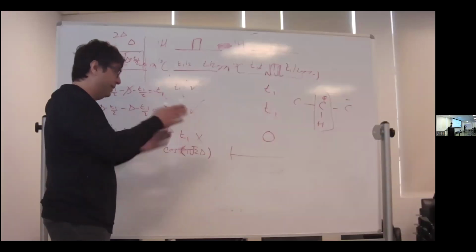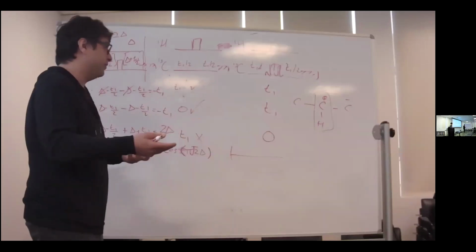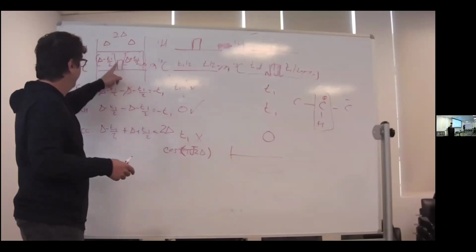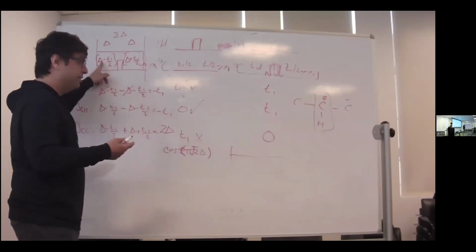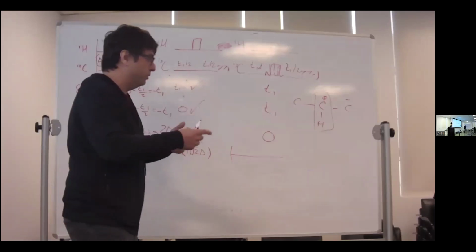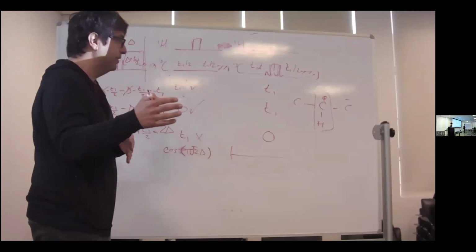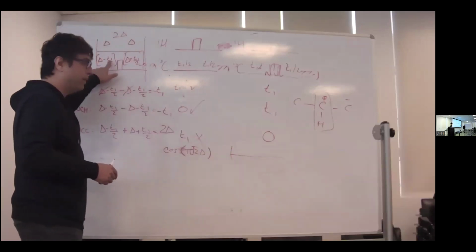Depending on the point you're measuring, the value of T1 will be different, right? It will constantly increase in time. I think what you're saying is that if T1 grows beyond that, then of course you're going to come out of this window, and your program would stop it. You would never let it go further than that. Yep. So there's a limit to how long T1 can be, because this gets maximum 0. So that is the maximum value we can assume.